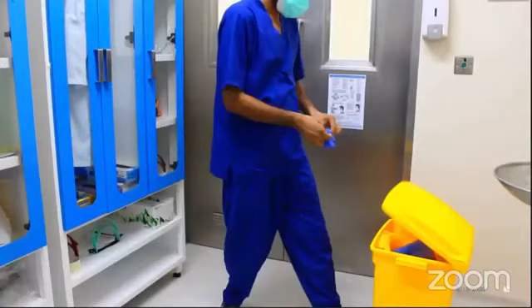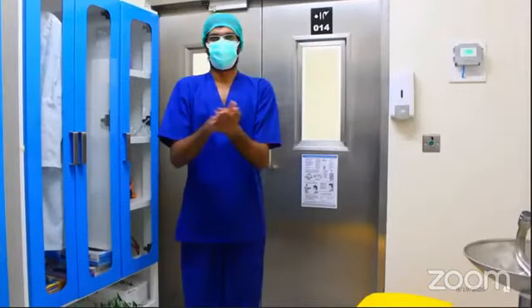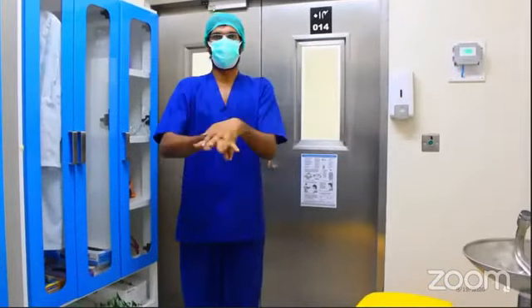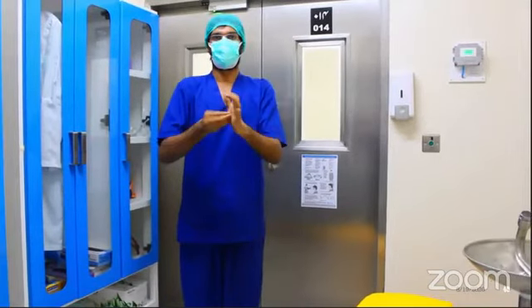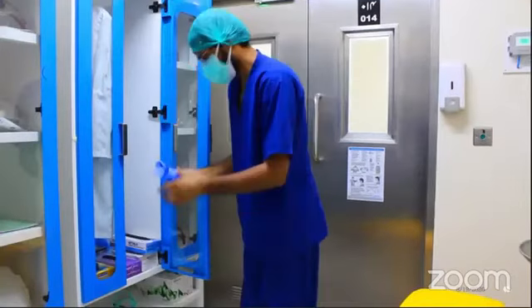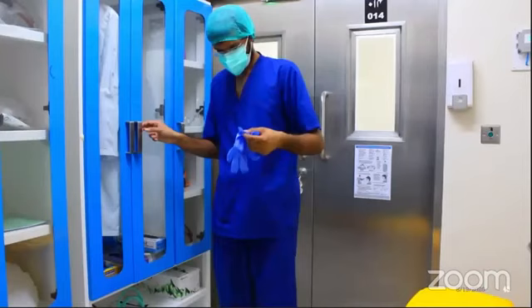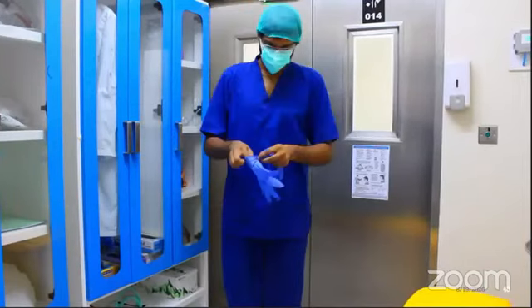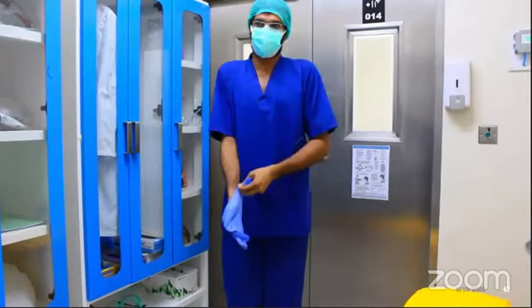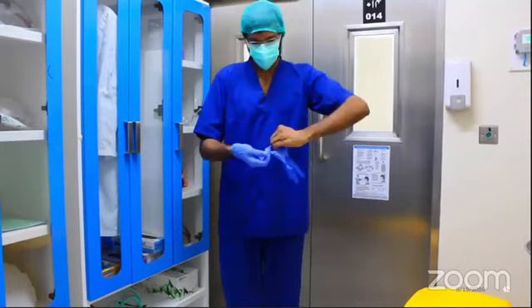Remove the gloves by inserting the finger inside the inside portion of the glove in order to avoid touching the contaminated surface. Disinfect the hands properly. Use a fresh pair of gloves after disinfection.